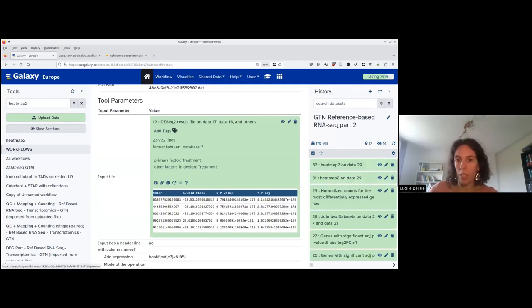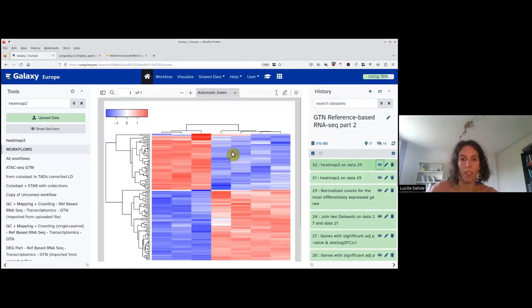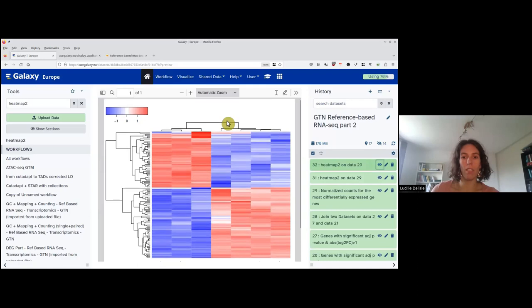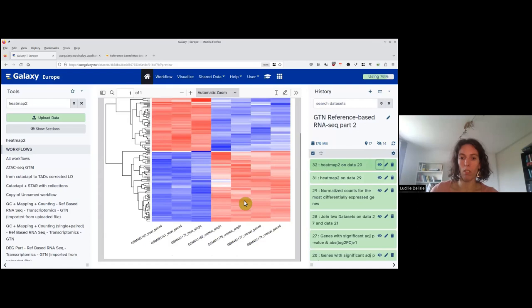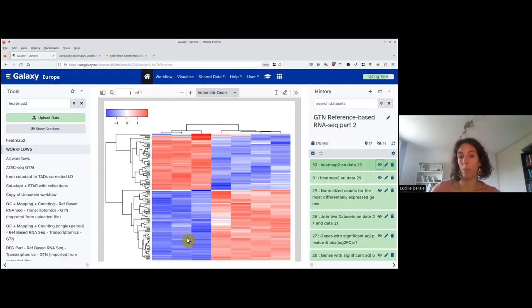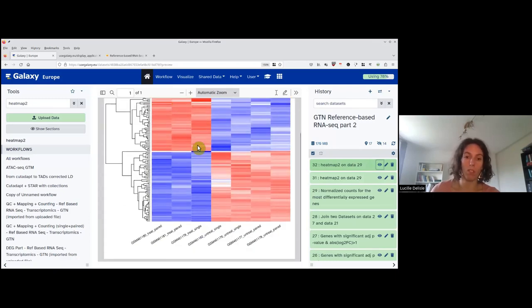Heatmap2 has finished. Clicking the eye, we see the results. Now we can see that genes that are overexpressed are clustered together on the top, and on the bottom are all the genes that are underexpressed following Pasilla depletion. We can also see a cluster of genes more expressed in the single compared to paired-treated samples, and a cluster of genes more expressed in sample 82 compared to the other untreated samples.